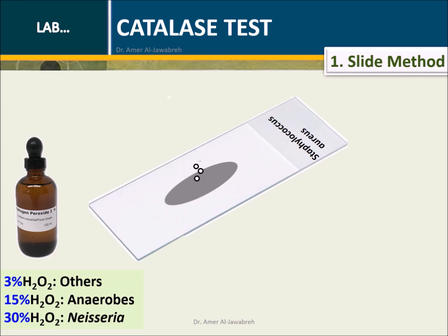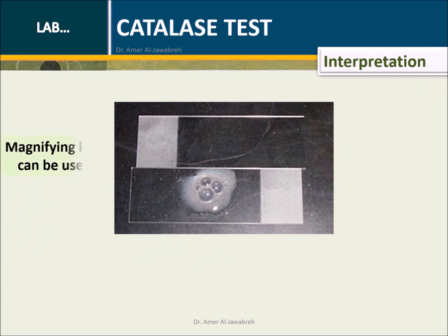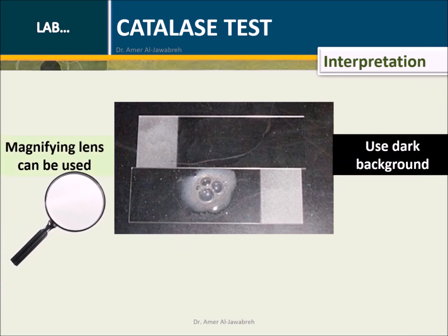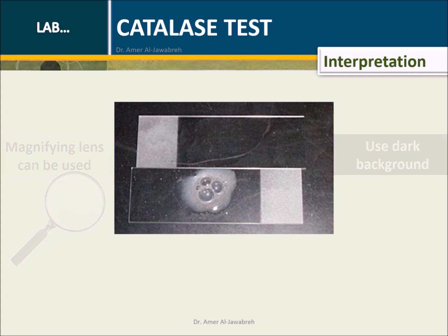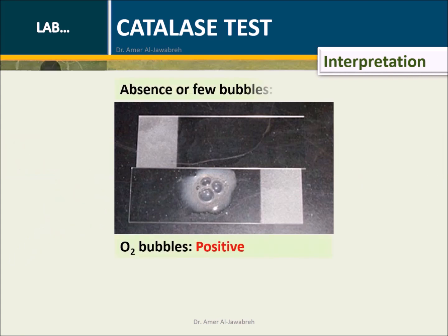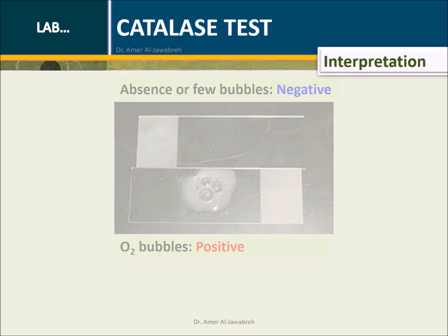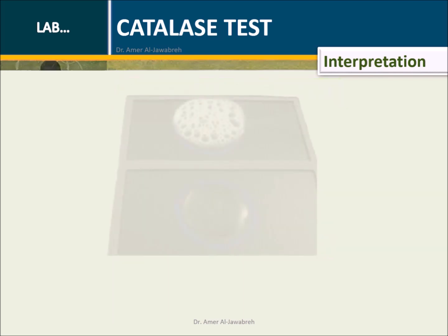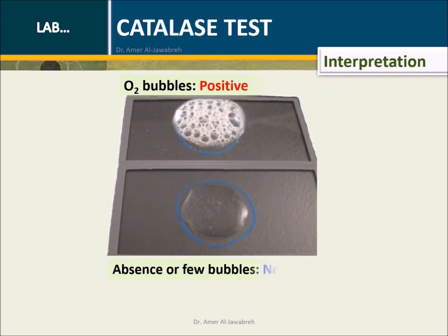Observe for immediate presence of bubble formation. Repeat the procedure for the other two bacteria. Interpretation: a magnifying lens can be used. Dark background enhances visualization. Presence of oxygen bubbles indicates positive results; absence or few bubbles indicates negative results.